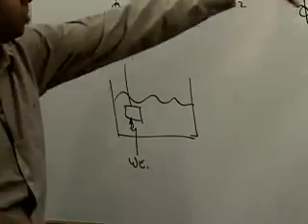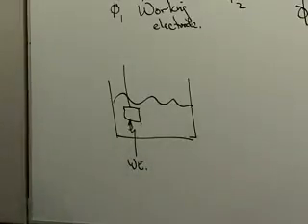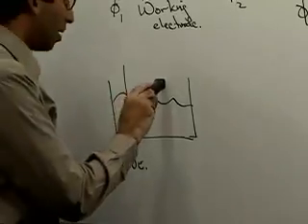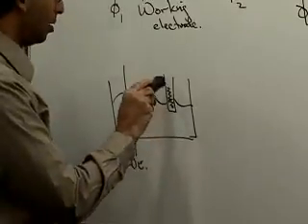But instead of just throwing in another electrode, let's take a half cell, a reference half cell. That is some electrode where we have the whole half reaction there. Maybe we have an iron electrode and iron 2+ ions in solution. Some nice half cell like that as a reference. And we'll have to have that in a separate container here.